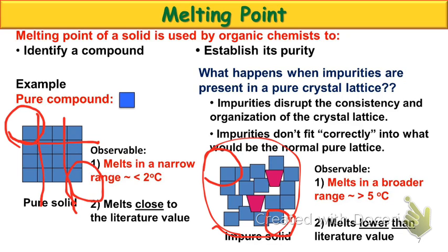Okay? What else could we potentially predict out of this? Okay, it's nicely covered up. As a guess, it probably has something to do with a literature value, right? Okay, what do you think is covered up? What do you think would happen to those intermolecular forces? Should they get stronger? So look at the picture. Does it look like the intermolecular forces got stronger? No, why not? You see gaps. You see air particles or air spaces.